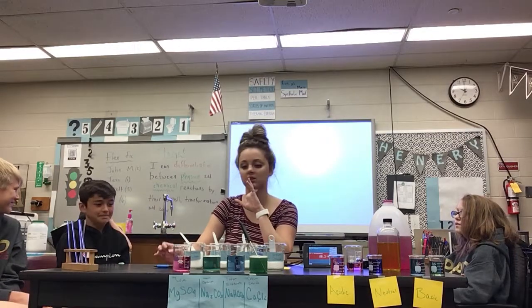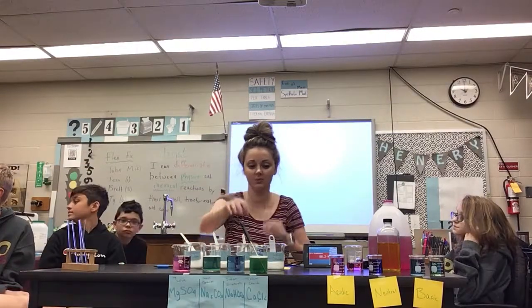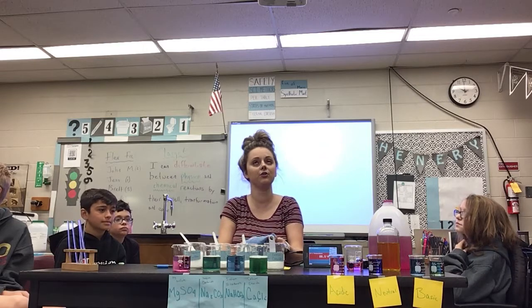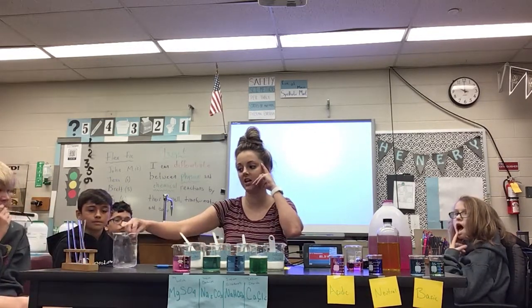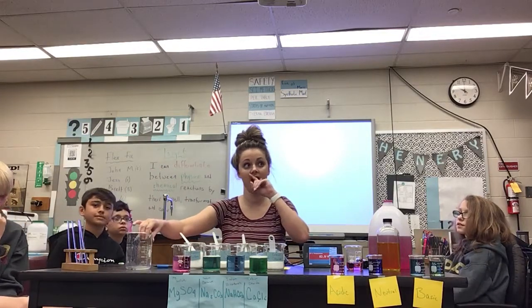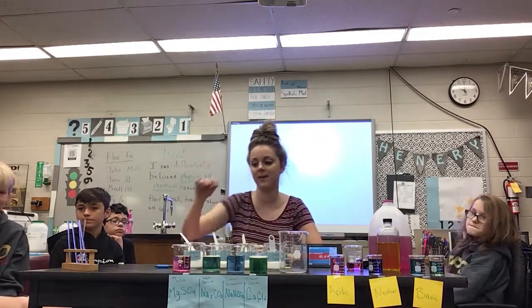All right. Now let's start to look at this. Ira, can you give me that big beaker? Someone said, can we combine them? If it feels warm, is it endothermic or exothermic? Don't say it yet. If it feels warm in 3, 2, 1. Exothermic. Exo. Okay. Let's see what happens when we combine this.